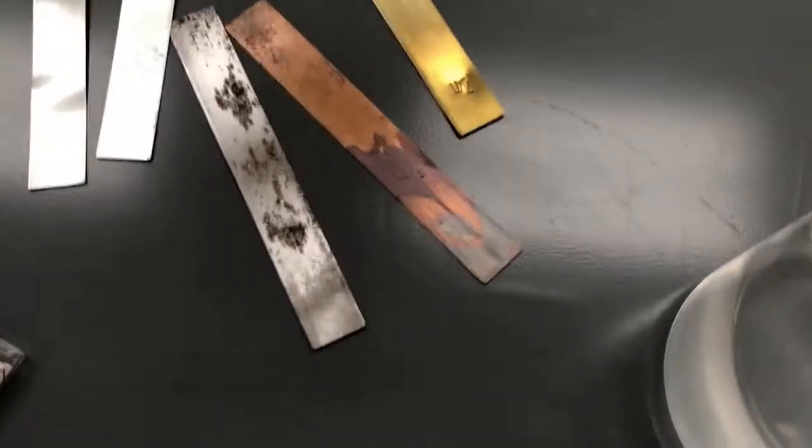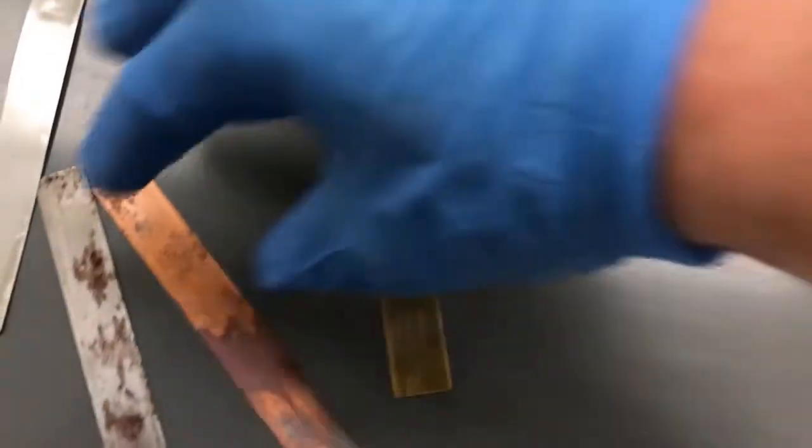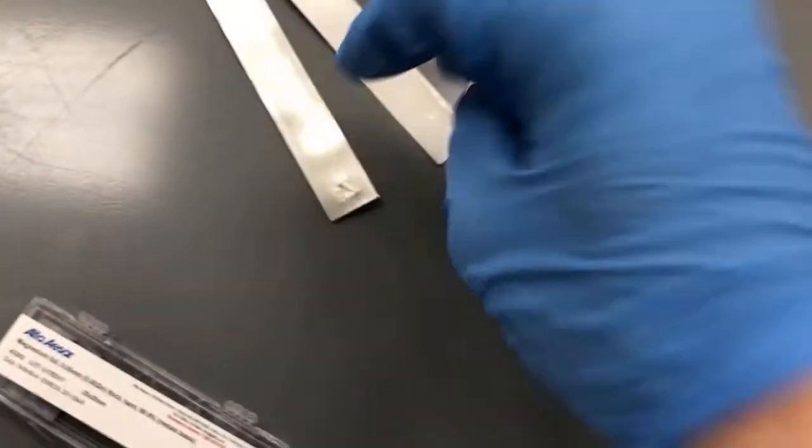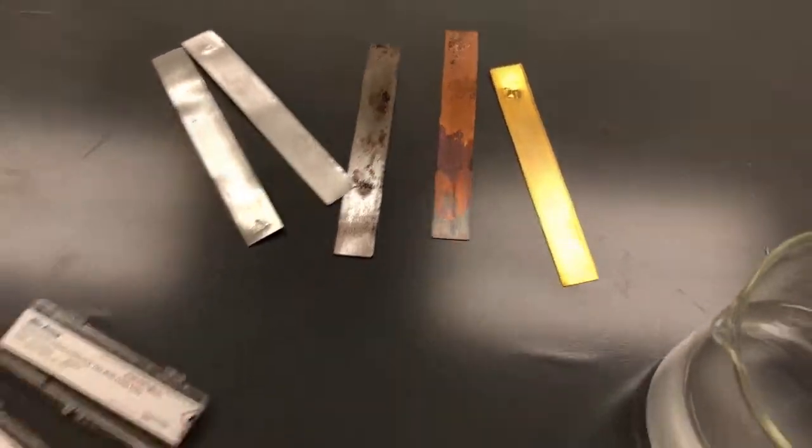I haven't cleaned these in a while, so these are the materials we're going to investigate. We have brass, which is copper and zinc. You can tell what's corroding and what's not. We have copper, iron, aluminum, and also zinc right here. We're going to clean these up and polish them with sandpaper.